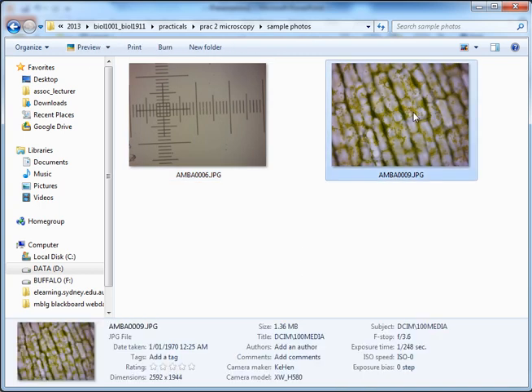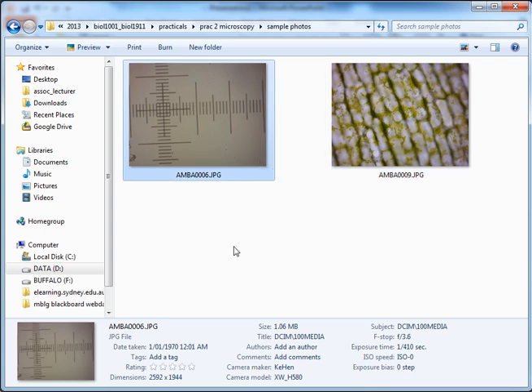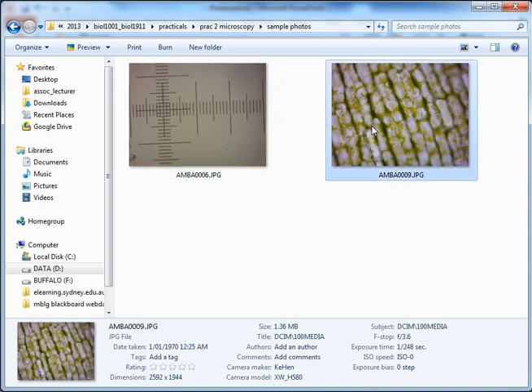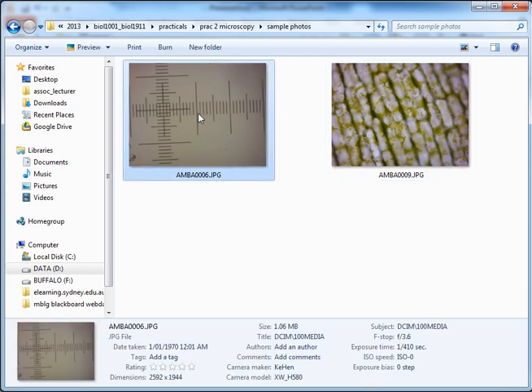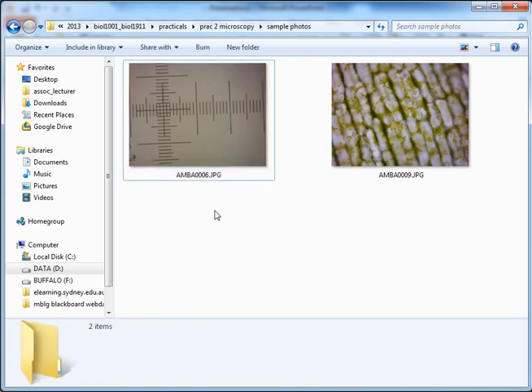We have two images: one is the actual image of the Egeria leaf, and another is an image captured of the calibration slide at the exact same magnification. The important thing is that you use an image of your actual sample and another image of something on a slide at the same magnification for which you know the measurements. In this instance, each one of those little bars on the calibration slide is 0.01 millimeters apart.